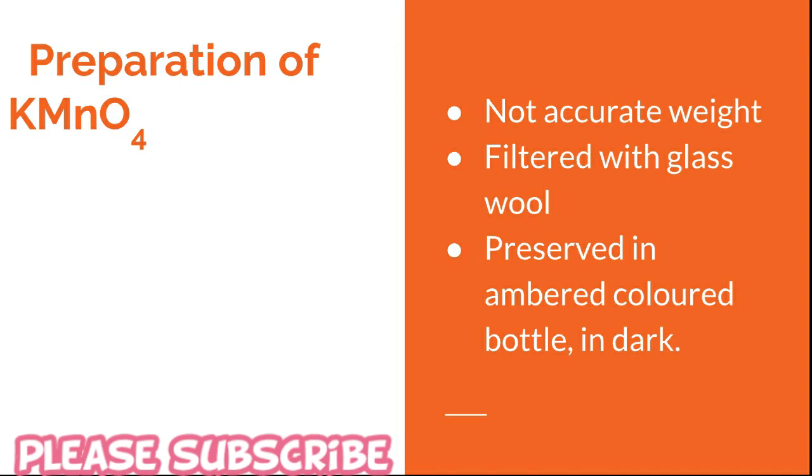And the next point is, if we try to preserve a KMnO4 solution, then we will have to prevent sunlight because KMnO4 photodecomposes. For this purpose, we need to preserve the KMnO4 solution in an amber colored bottle, and we will have to place that bottle in a dark place, with black paper folded around the bottle. As a result, the sunlight will not come in contact with the KMnO4 solution and its strength will not change sharply.